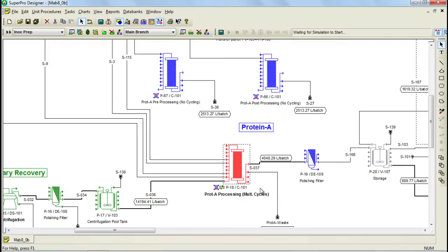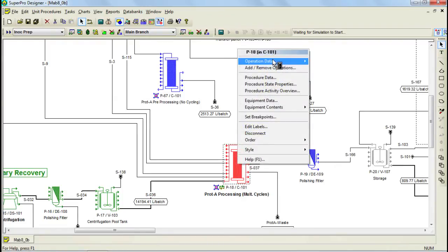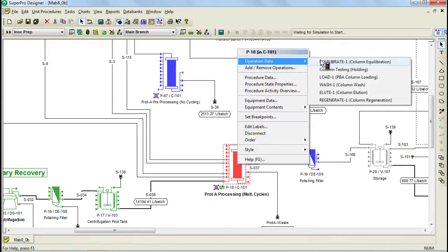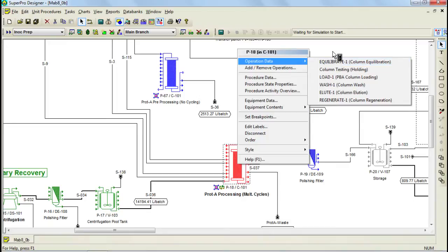Specifying an amount of 4 cycles means that all the operations from this unit procedure are going to be carried out 4 times. So we start with equilibrate, it goes on to the other operations, and when it finishes, it starts again with equilibrate, and it does this a total of 4 times, or the amount of cycles which you have specified.